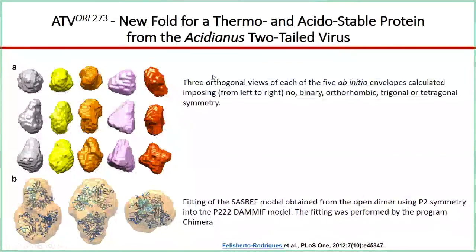And what was particularly intriguing about the protein was pH and temperature-dependent oligomerization states. Right? They were purified at between 7 and 8 pHs, and it was shown to be tetrameric using MALS data. So unfortunately, this was at a time when SEC-MALS SAXS instruments were non-existent. So they did MALS separately and then SAXS separately on a variety of different conditions. So inline chromatography on a SAXS instrument was also not quite common yet. So all these were batch experiments.